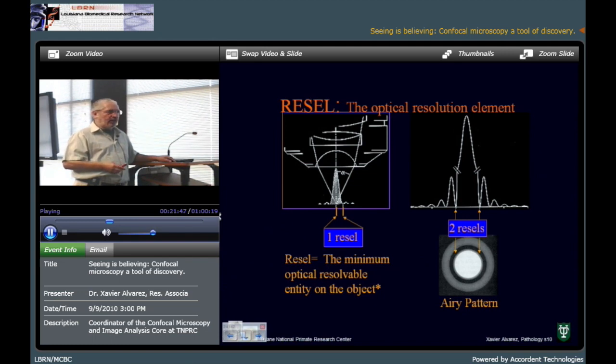Here all the lenses and so on are very important, but the critical part is the wavelength of the laser that we are using. We are very near to the resolution limit of the light that we are using, and also of the diffraction effects that we have passing from glass to tissue to glass. Okay, that's the limit.